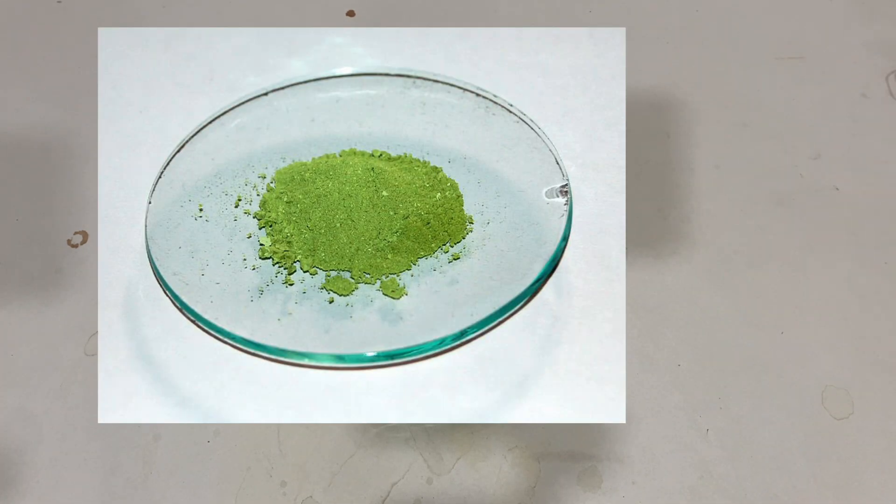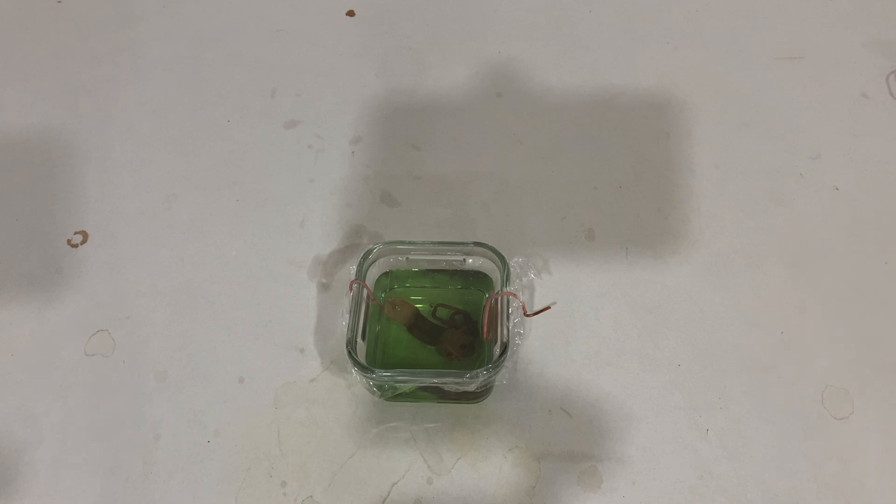It's clearly cupric chloride because it's green. There's another type of copper chloride salt which is blue, and this is green. So yeah, this is cupric chloride.